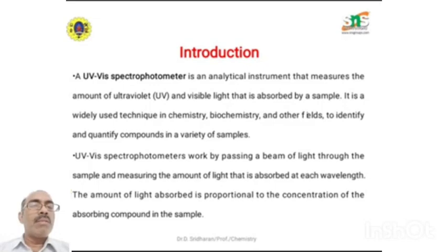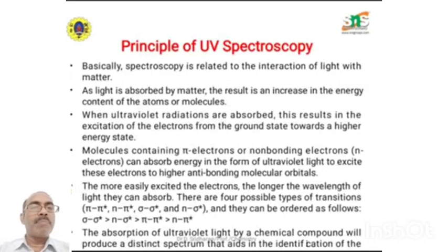It works by passing a beam of light through the sample and measuring the amount of light that is absorbed at each wavelength. The amount of light absorbed is proportional to the concentration of the absorbing component in the sample.